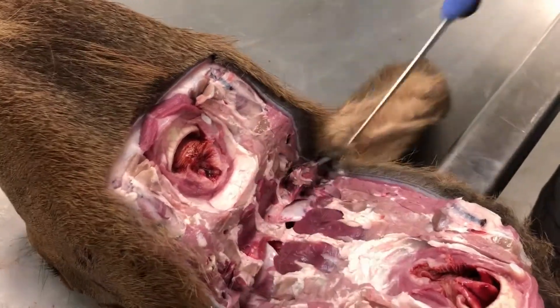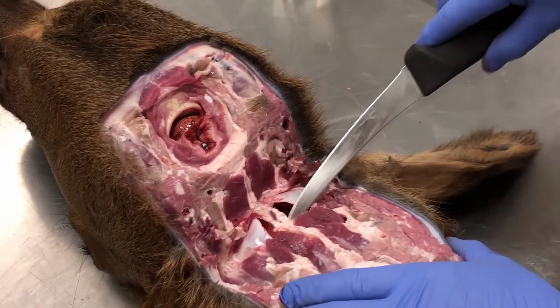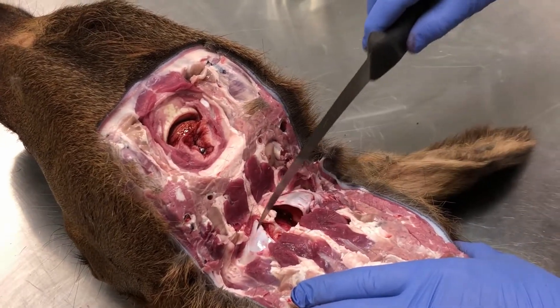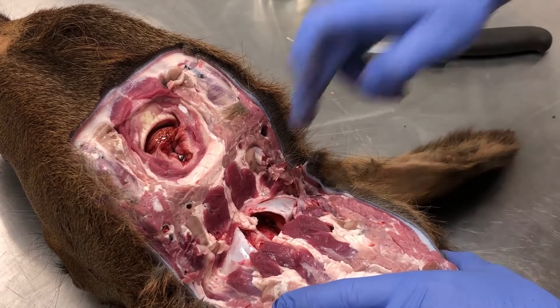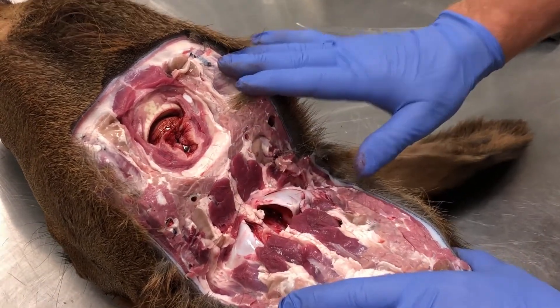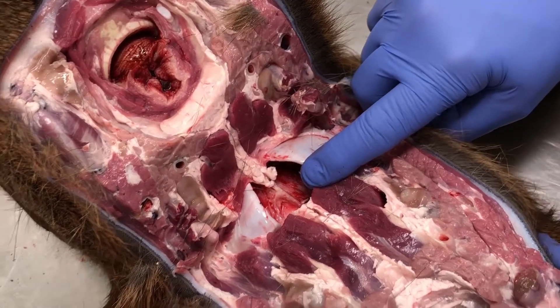Ideally you'll come right down here where the foramen magnum is — these are the occipital condyles right here. Now here's the obex, but we're not going to show you the obex pulling today. We're just going to go for the retro pharyngeal lymph nodes.